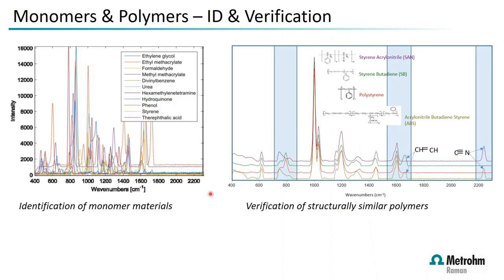For plastics, packaging, monomers as well, so in plastic production itself, the Raman shows extremely good selectivity for different types of plastics and also their raw materials, so it's used extensively both for plastics verification and also in the production of plastics, so raw materials for the plastics environments and final product.